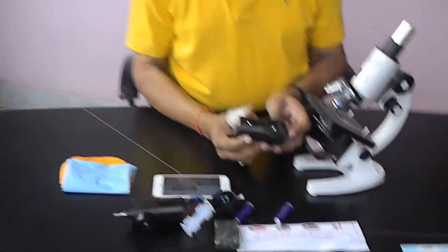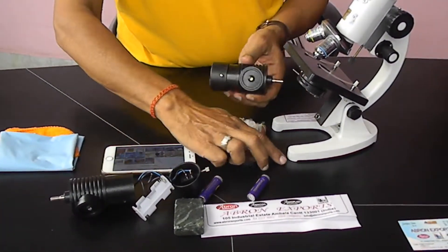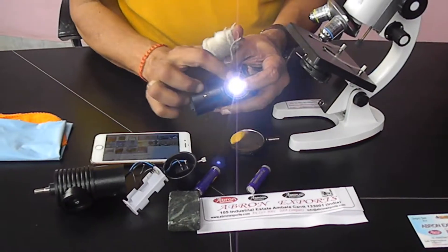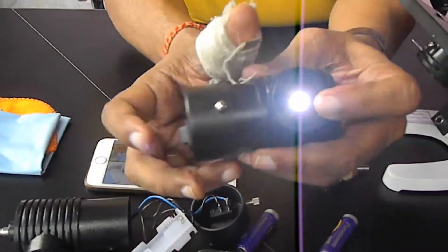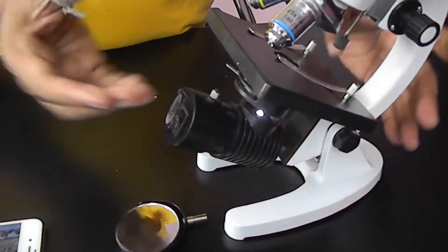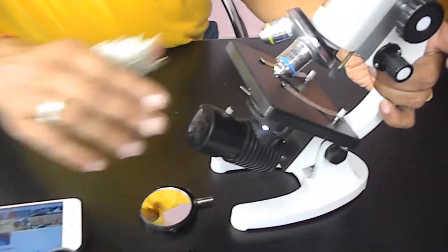This is the microscope lamp substrate. It's very easy to use — remove the lens and there is a switch. This works with an LED light; you can see the LED light and switch it on and off. Just put it here and the light goes from here.